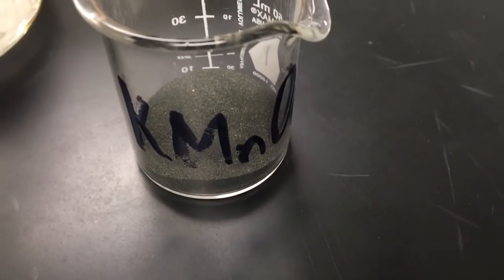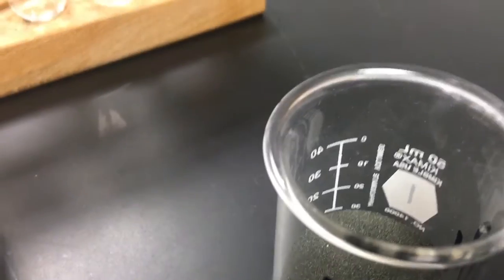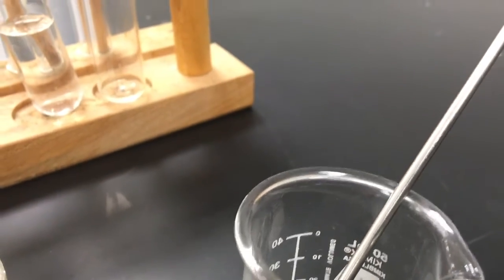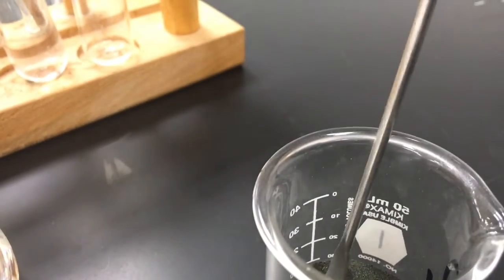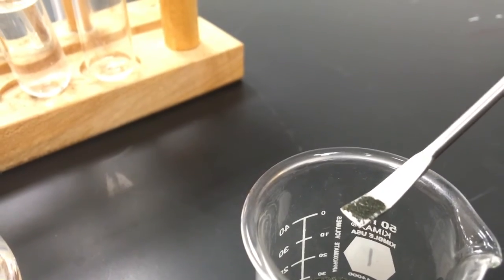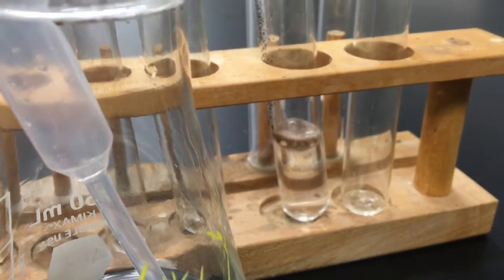Not super interesting stuff. And we're going to get a super tiny scoop of that. And by super tiny, I mean we're using this itty bitty little spatula here and getting just that much of our potassium permanganate. We're going to add that to our test tube.